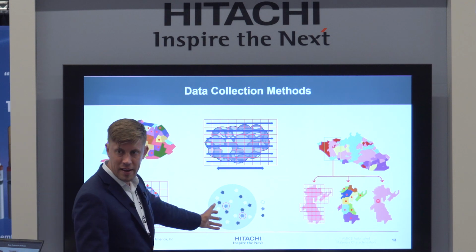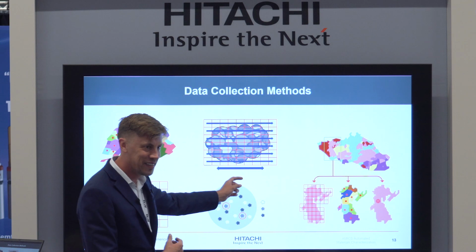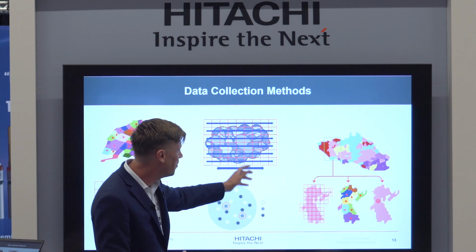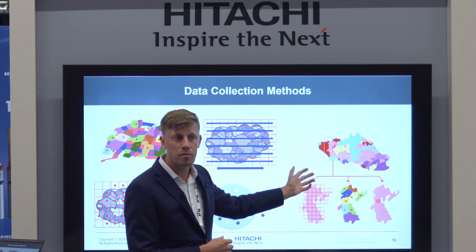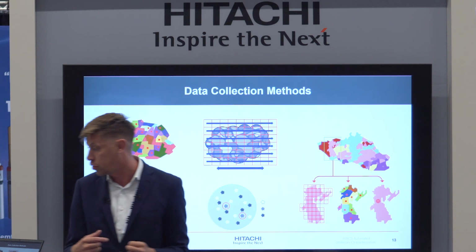We have rare phase search. This is the cartoon that you guys are allowed to make fun of. PowerPoint special. And then we have triggers. So what we can do is we can trigger different mapping modes based on criteria within it. So I'll go through each of those.